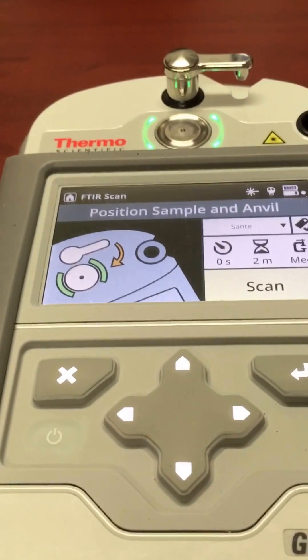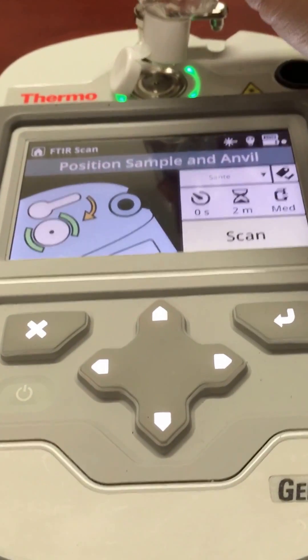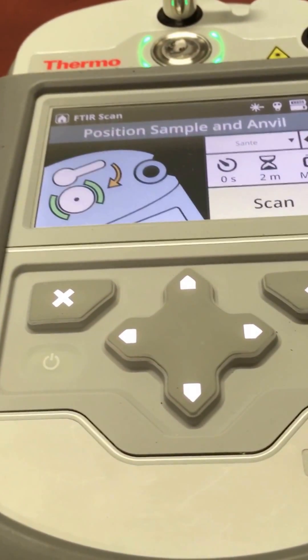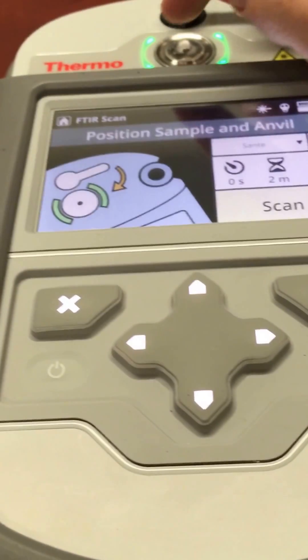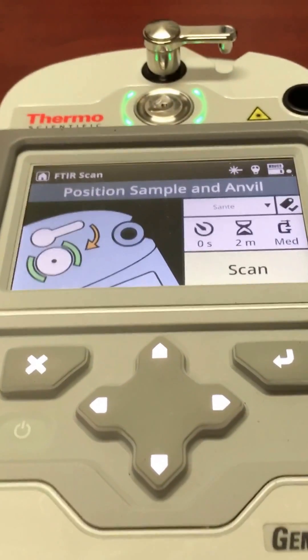I put the sample on — I'm using a gel. Hit scan.